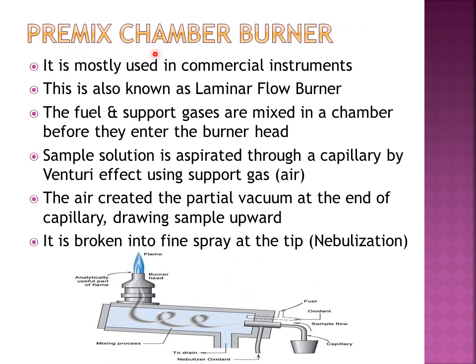The next design is the premix chamber burner. It is mostly used in commercial instruments, so it's a popular one. It is also known as the laminar flow burner. And what happens in it? The fuel and support gases are mixed in a chamber before they enter the burner. Here is the diagram. Here come the fuel and oxidant, and before entering the flame, both of these components are mixed in a chamber. So there is a pre-mixing of these components, and that is why this one is called the premix chamber burner.